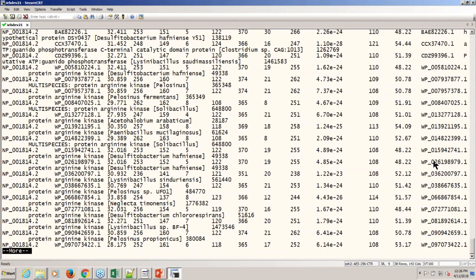You can remove that easily with a command that uses cut. Cut is a thing that works with columns, and I could just tell it, cut this column right here out, and use a switch called complement that says, give me everything except that column, and you would get the table back. Right? That's enough of that kind of stuff. Let's move on to talking about getting sequences, and then we'll finish up.